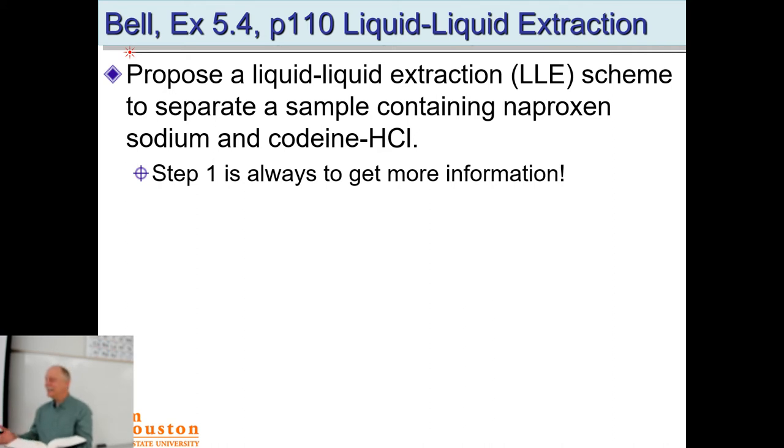Right? So it's not that toxic. So you could use the LD50 to give you an idea. And that's a 50-50 chance of dying. So you might even survive that. But the real information we want in here is the pKas and the solubility. And you can find that information here, and that's summarized in this table that we have.